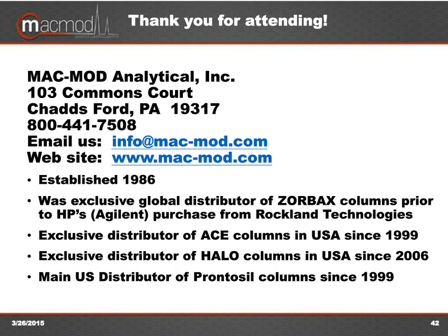Some instrument manufacturers, if you're going to work exclusively at high pH for a long period of time, I know Agilent, having worked there, they have a high pH kit that you can modify your various models of your HPLC system with to get rid of some of the Vespel and so on, and replace the polymers with other ones that can handle the high pH better. But I've worked at high and low pH over a month's time here and there, and have had no observed problems with any damage to the instrument.